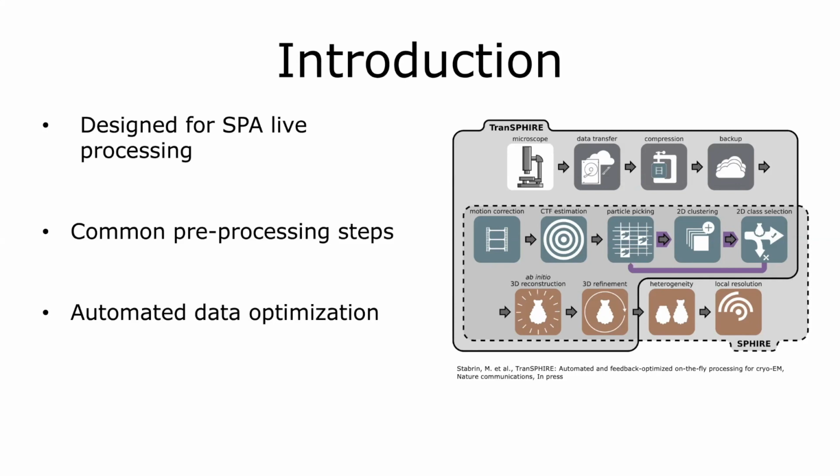So what we are trying to do is get the most out of the data in a short amount of time while the data acquisition is still ongoing. Which means that TranSPHIRE is running live next to the microscope, or is designed for this purpose, and it covers most of the common pre-processing steps.